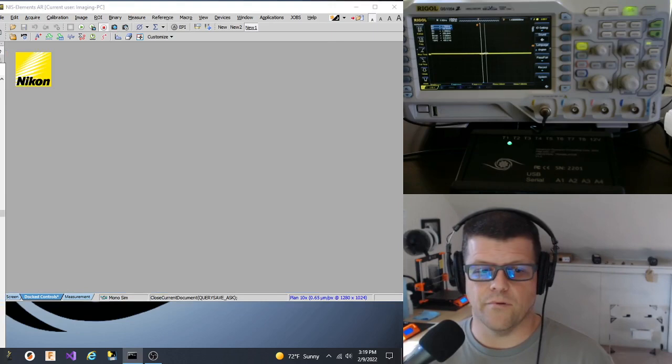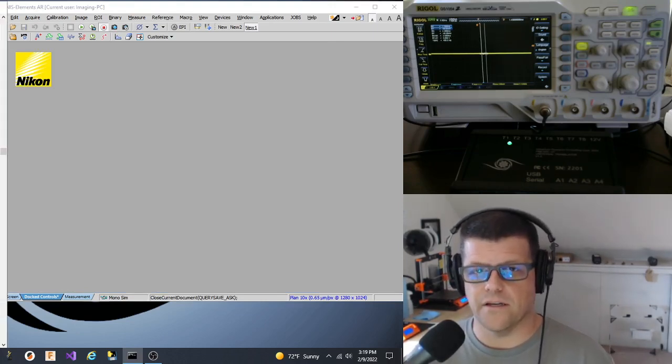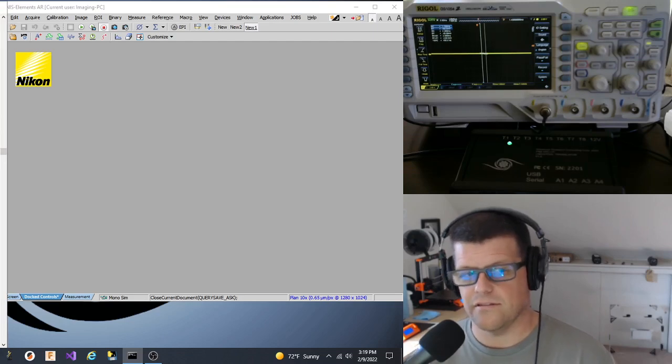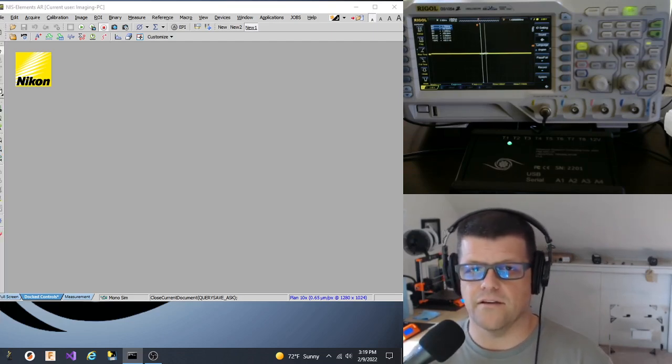So that's an example running just a VMMD1. That's a relatively simple device because there's only 2 commands. It's on or off. A more complicated device would be something like a Spectra X.